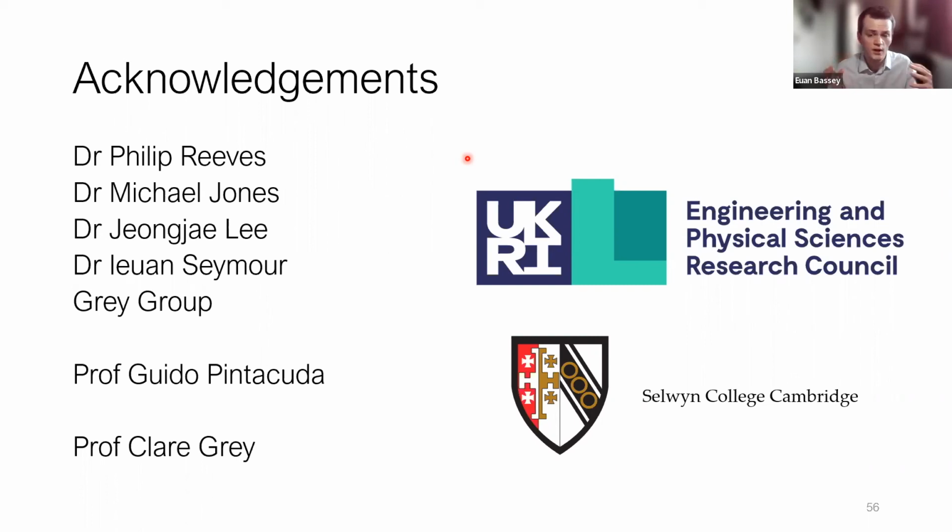I've also acquired the VT data at different fields just to try and see if you can see a change in the spectrum, and there's no real change in those at all. So there's no significant quadrupolar interaction. Okay. And is that also the case for the magnesium and the oxygen? Yes, it is. Okay.